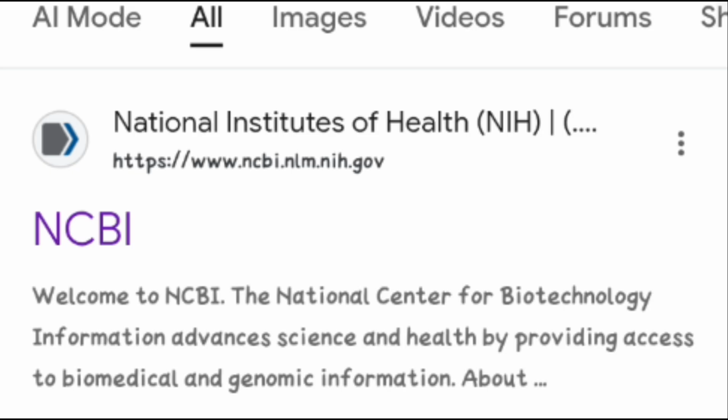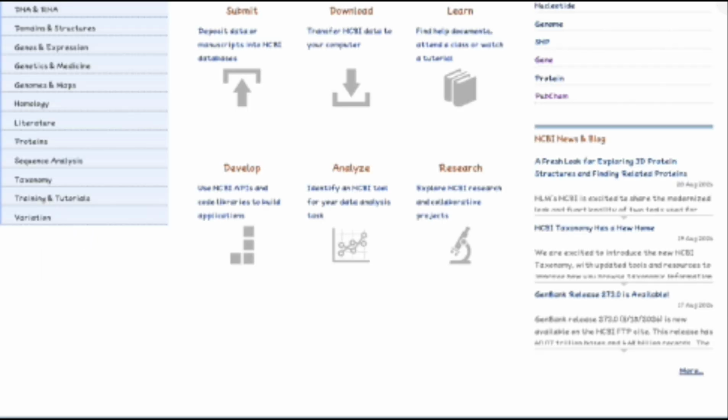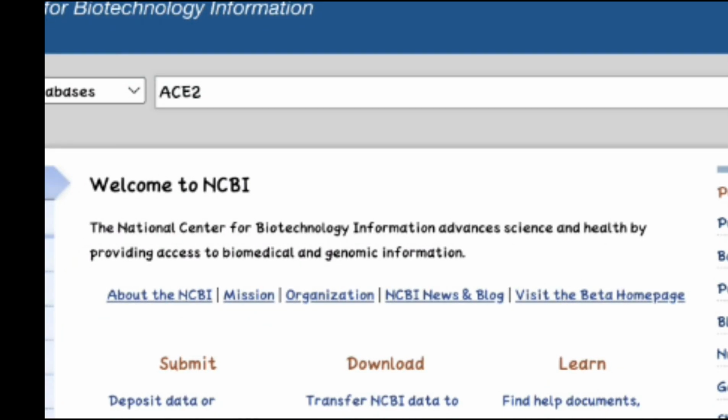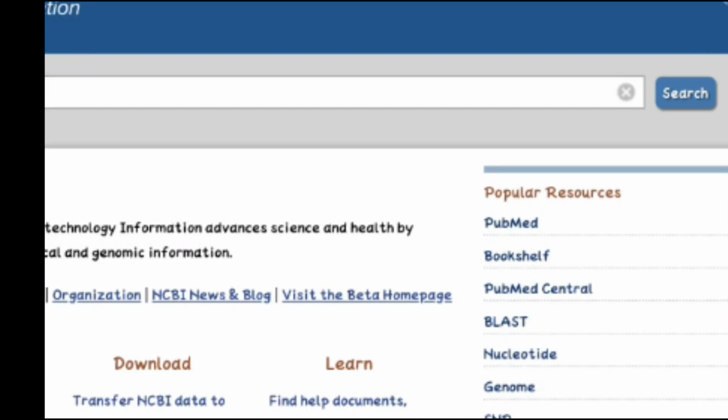Welcome to the qPCR Primer-BLAST tutorial. First we are going to open the NCBI website. After that we are going to select ACE2, for which we are going to design the primer. So here, after typing ACE2, we are going to search it.